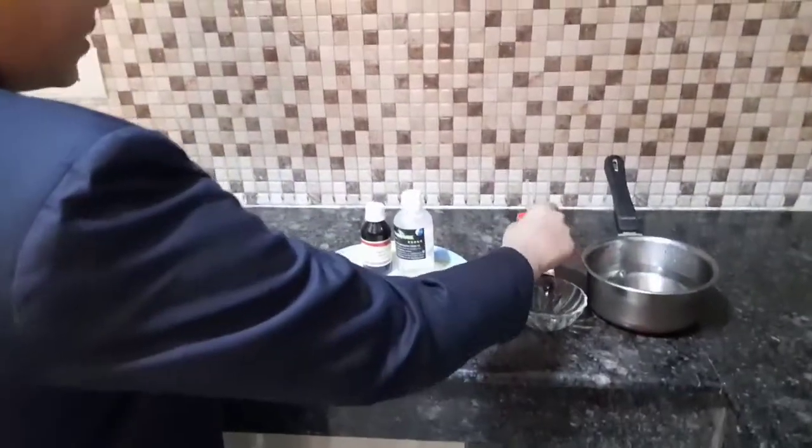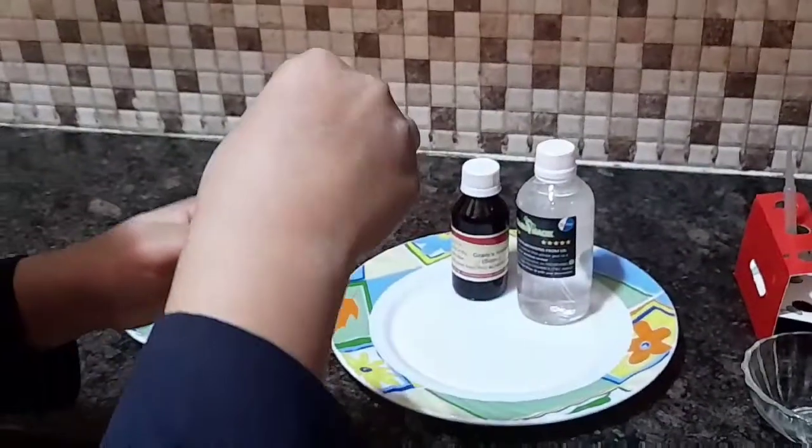Everyone, my name is Madhav and today I am going to perform an experiment in which I will test if leaves contain starch. So now I will put a leaf into this test tube.